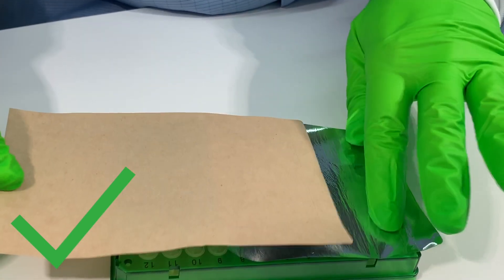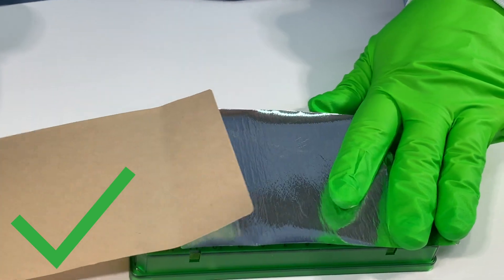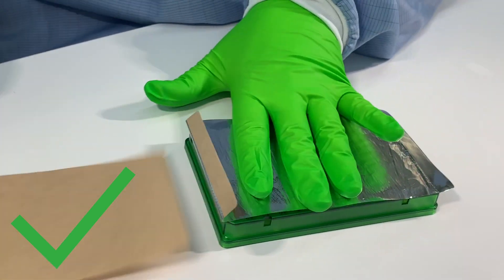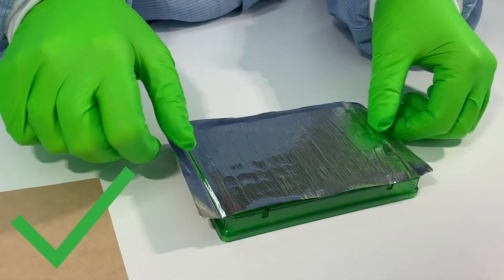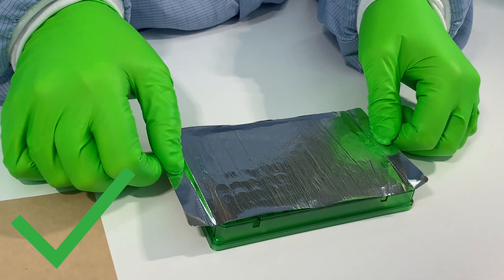Press the seal down on the sticky side, then remove the protective seal by pulling it over the other edge of the plate. There should now be non-sticky wings on both sides.